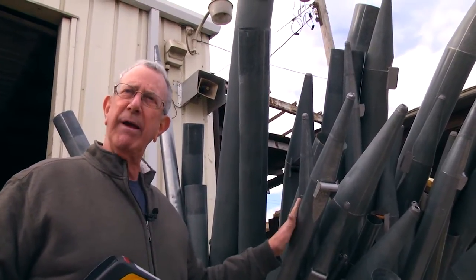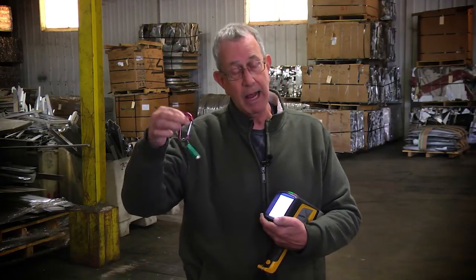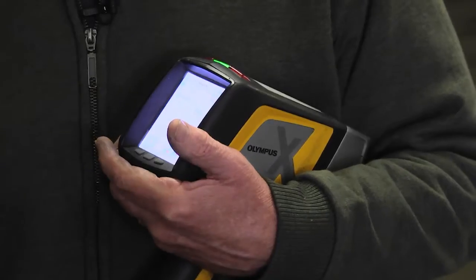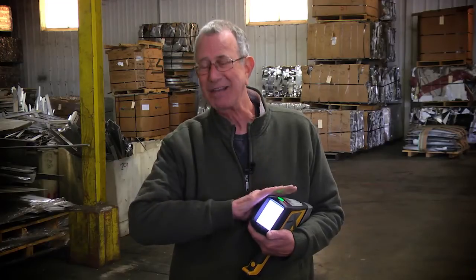I've been in the scrap business for quite a long time. It used to be the tool of the trade was the magnet, which is still a reliable instrument, but this is what we base everything on pretty much. I feel fully comfortable referencing this — it is a positive resource to have in the day-to-day business.